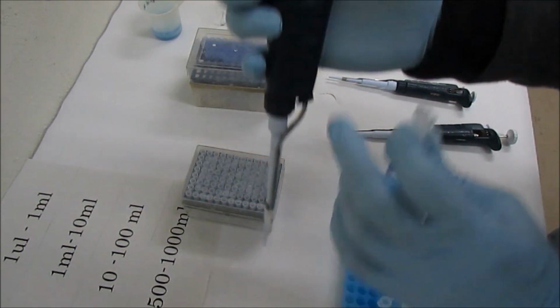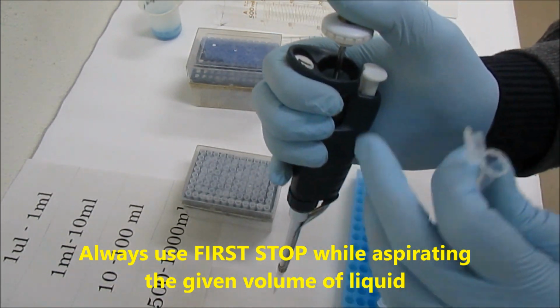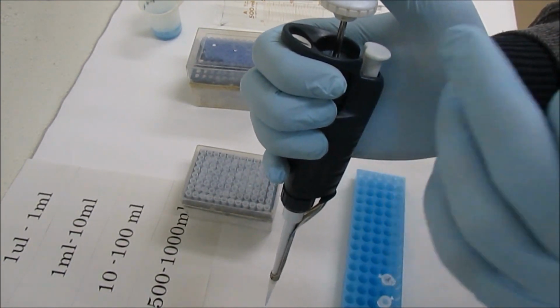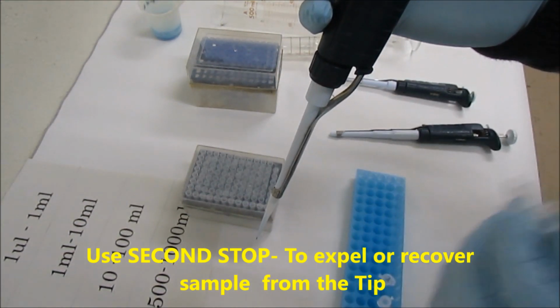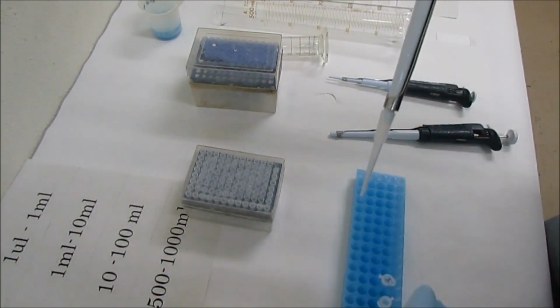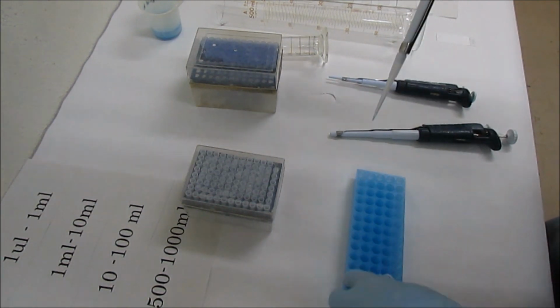The first stop is used when you want to take a specified amount of liquid, and the second stop is used only when we want to expel the liquid. Whatever residual volume is inside the tip, we use the second stop to expel it.